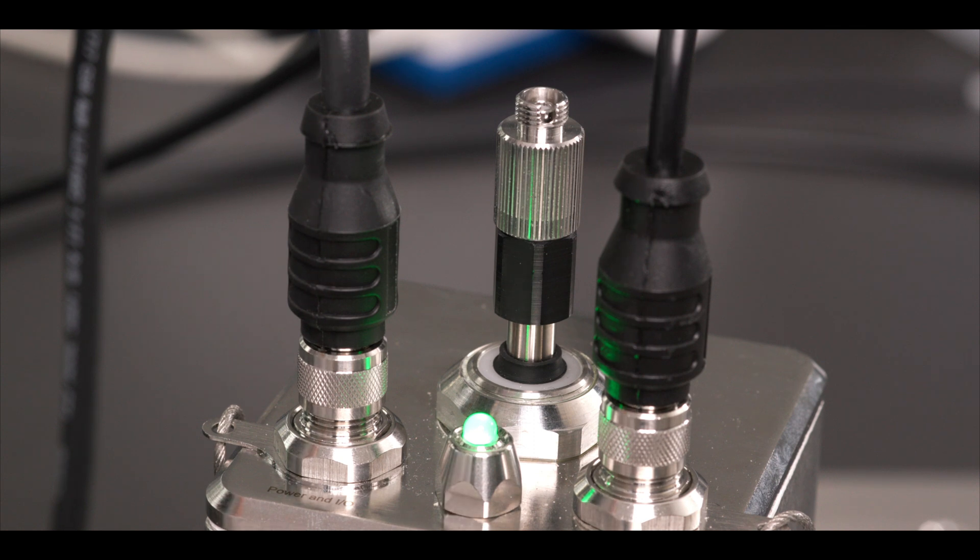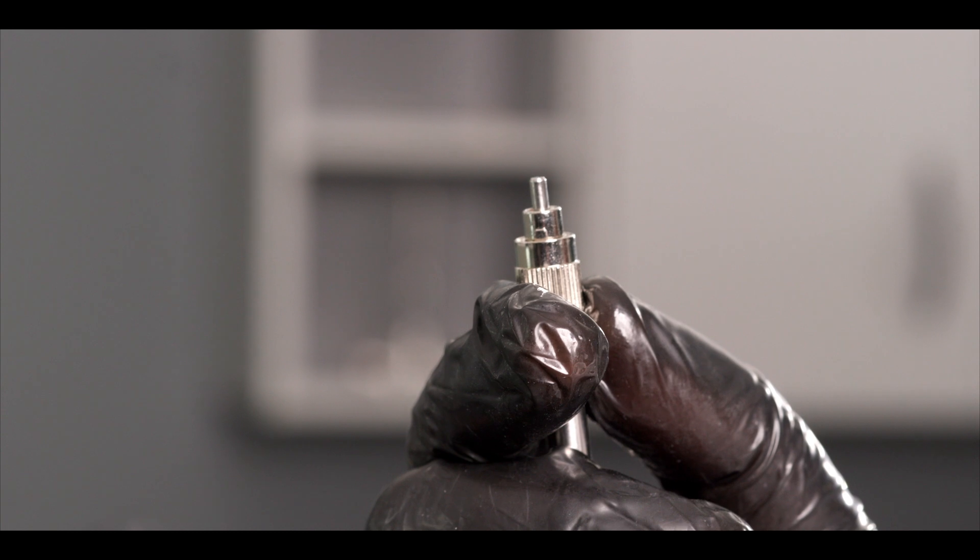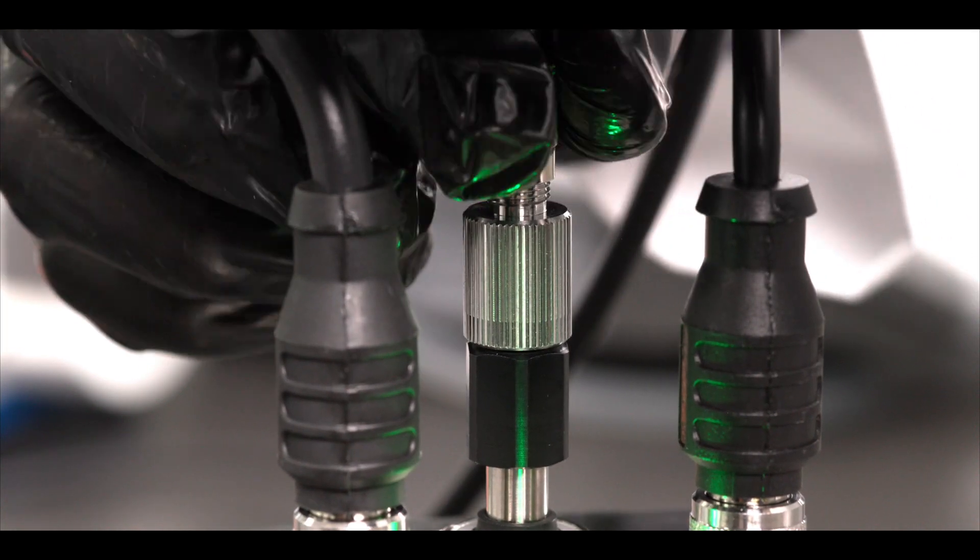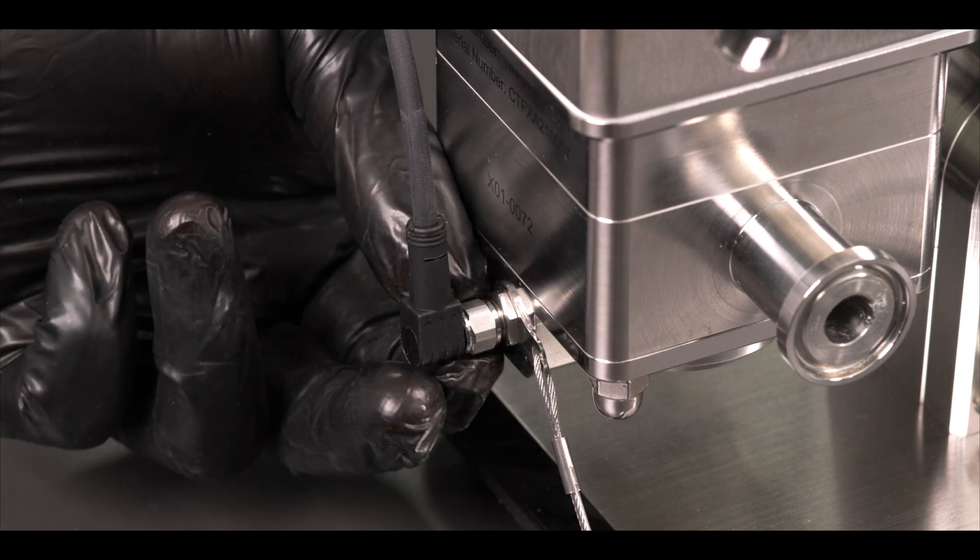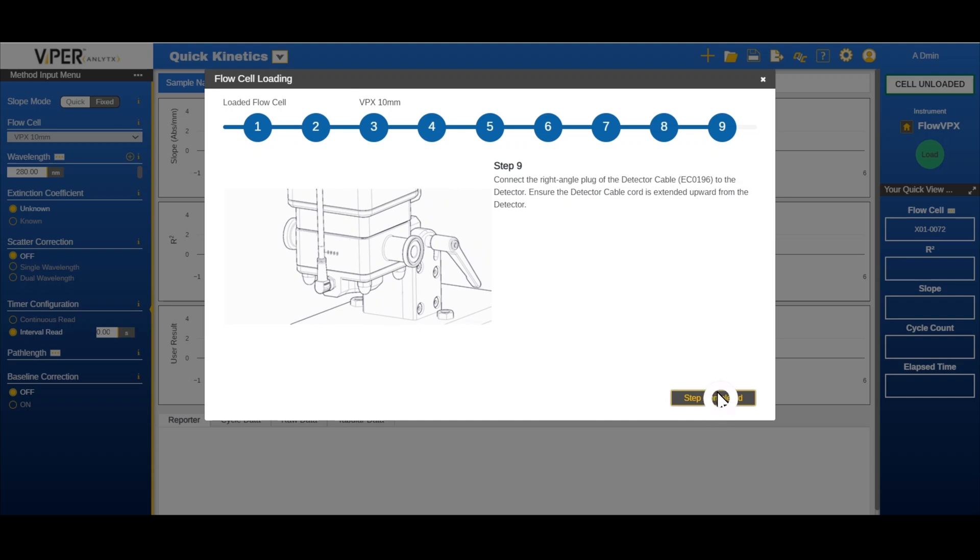Wait for Viper to find the zero position. Then click next step. Connect the delivery fiber to the fiber optic component by lining up the notch with the keyway. Then connect the Cary 60 detector cable to the detector, making sure it is pointing upwards. Click step completed.